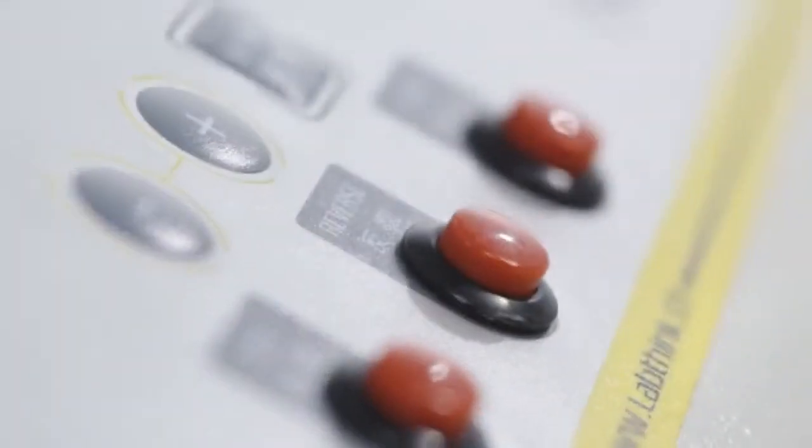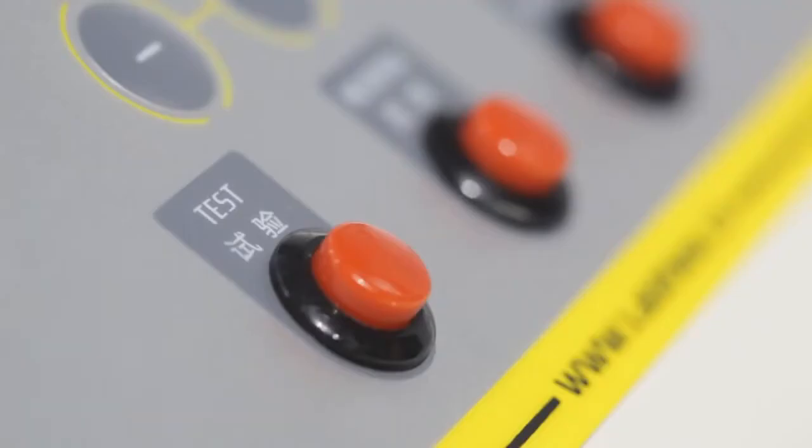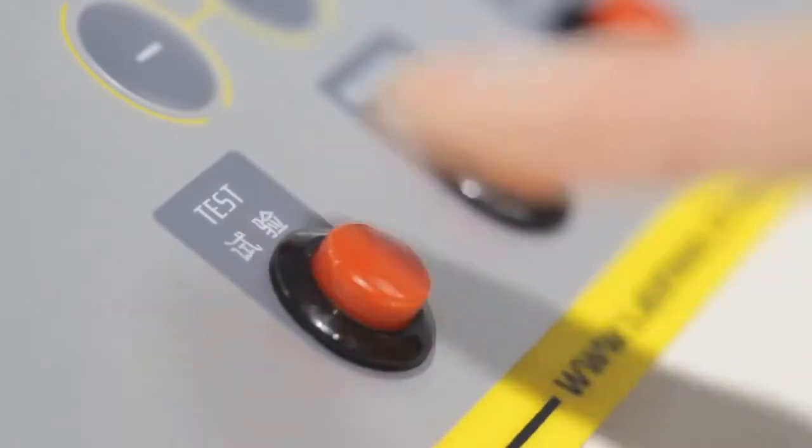This entire process is monitored and controlled by high precision manometer and microcomputer.